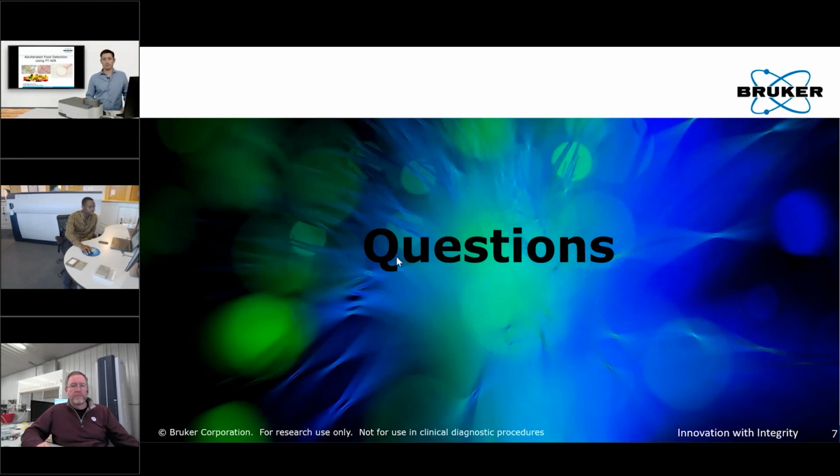Right. Thank you, Chris. And it looks like there's one for me here as well. Is MALDI also capable of resolving polymers at much higher masses?